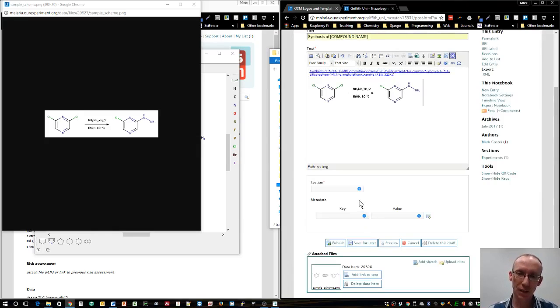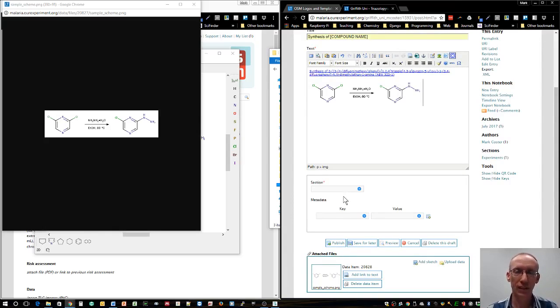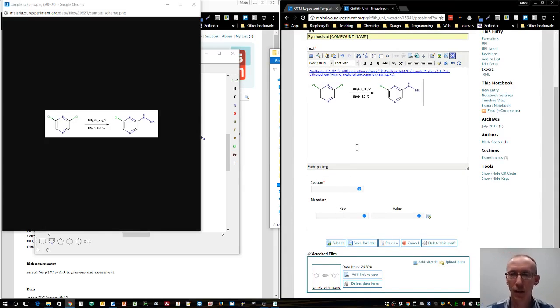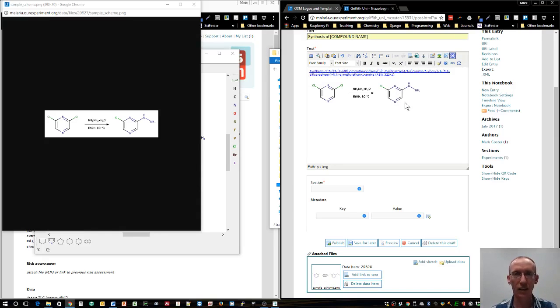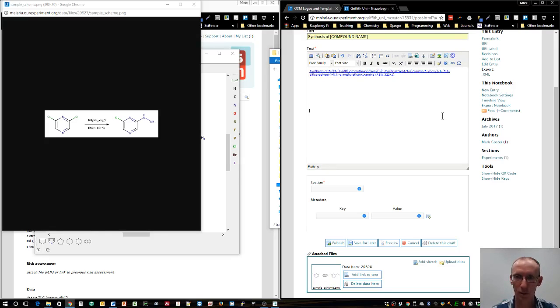We could say synthesis of blah from blah. I've done that before, and just click on insert. If you don't put that description in, it comes up with a warning. Now our reaction scheme is nicely inserted inline into the lab notebook entry.